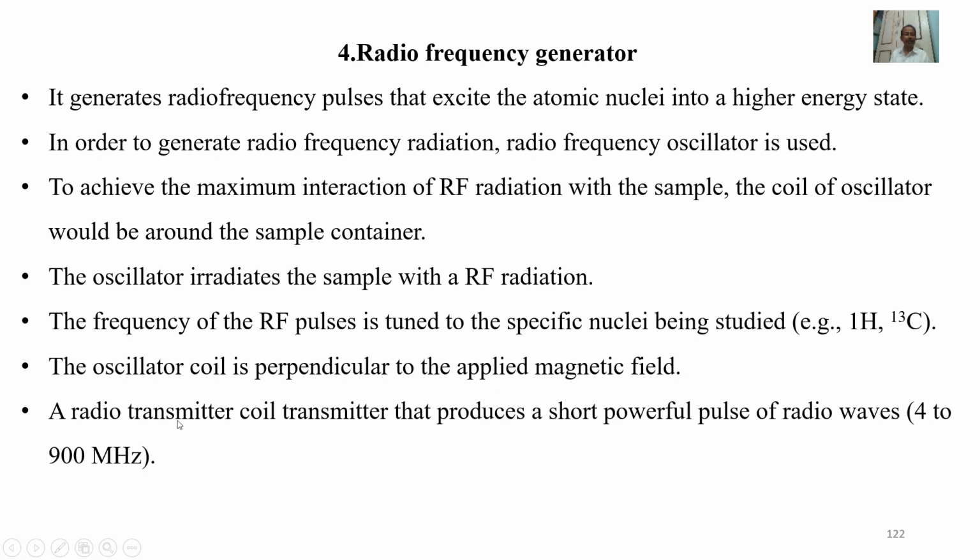A radio transmitter coil that produces a short, powerful pulse of radio waves 4 to 900 MHz.